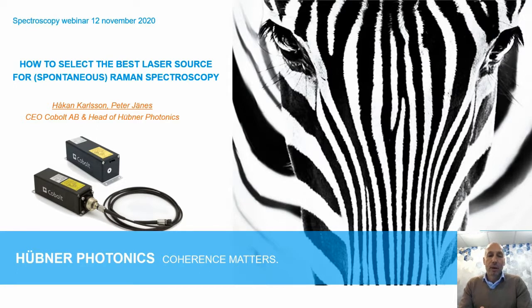So we're going to talk about some of the aspects that should be considered when trying to select a laser source for Raman spectroscopy. And we're going to talk about some of the available laser technologies and how they differ between each other in performance parameters that are critical for Raman spectroscopy. And finally, with the help of my colleague Teresa, we're also going to show you a bit of how we here at HÜBNER Photonics are characterizing the performance of the lasers that we make, and in particular in regards to performance parameters important for Raman spectroscopy.